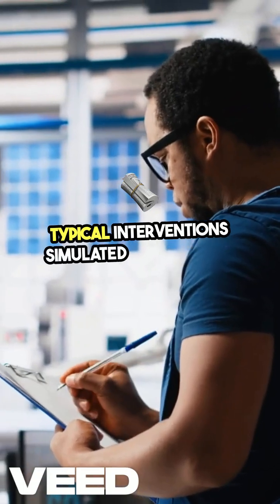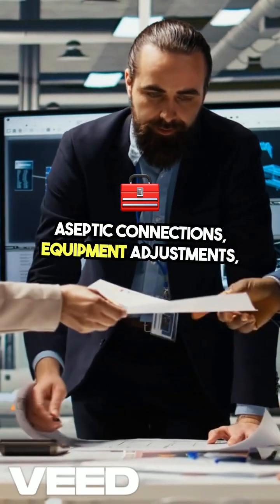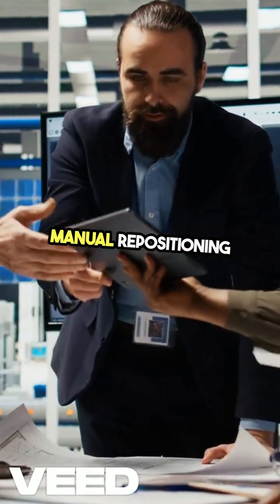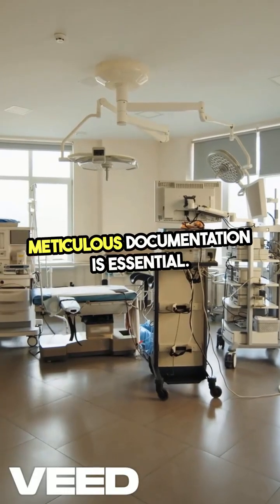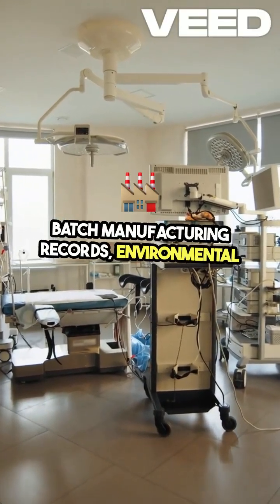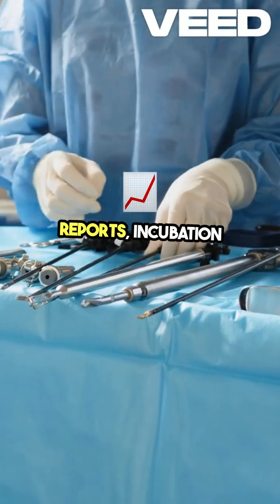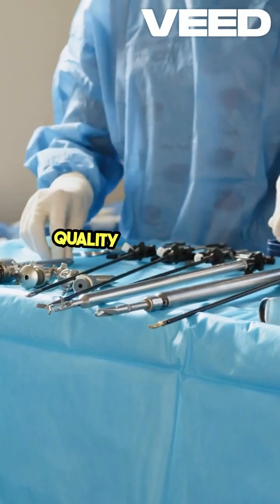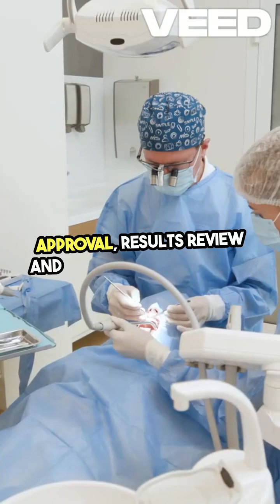Typical interventions simulated during media fill include aseptic connections, equipment adjustments, cleaning of filling needles, handling vial jams or manual repositioning, and operator changeovers. Meticulous documentation is essential. This includes batch manufacturing records, environmental and personnel monitoring data, media fill protocols and reports, incubation records and growth observations, and any deviation reports. Quality assurance is responsible for protocol approval, results review, and compliance oversight.